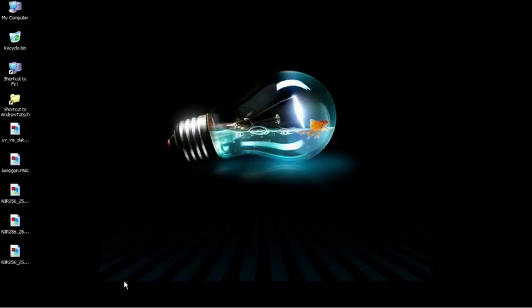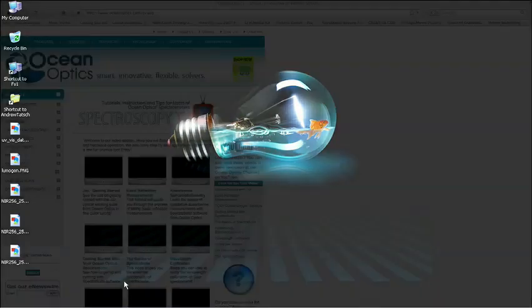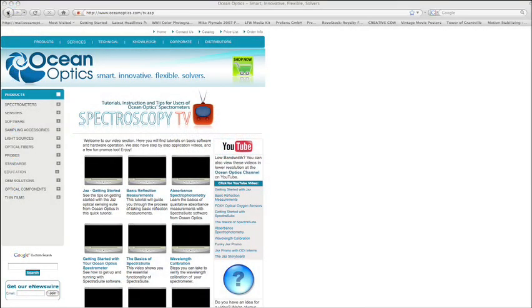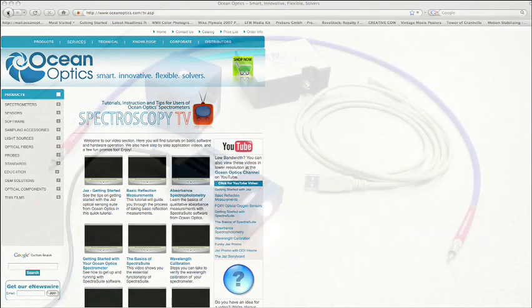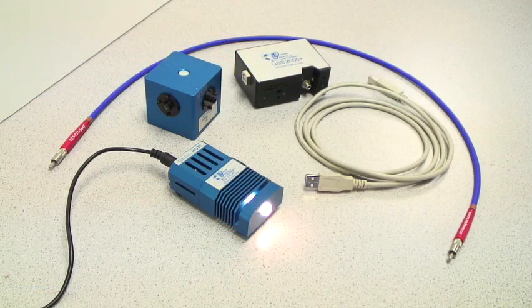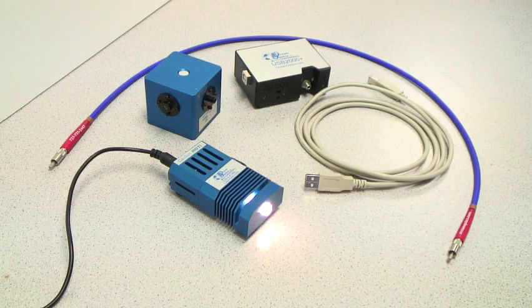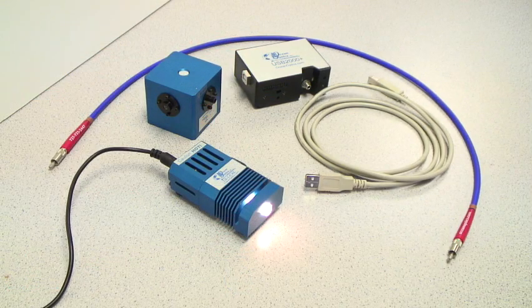This tutorial assumes that you have already installed the drivers for your spectrometer and have SpectraSuite installed on your computer. If not, please log on to OceanOptics.com and download the tutorial for getting SpectraSuite up and running on your PC.